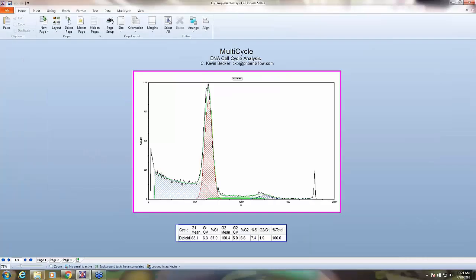Welcome, everybody. My name is Kevin Becker from Phoenix Flow Systems. I'm dating myself when I say that I have been selling this product for close to 30 years, but flow cytometry is one of those infectious things that makes people stick around for a while. So I'm still here, and I'm still hanging with cell cycle analysis.